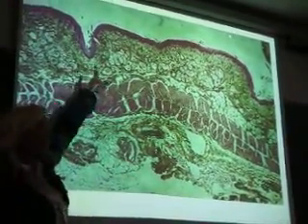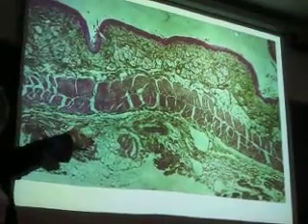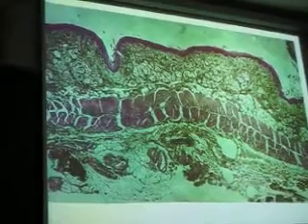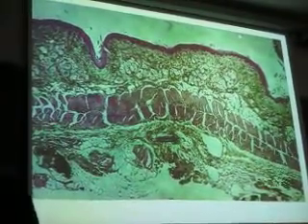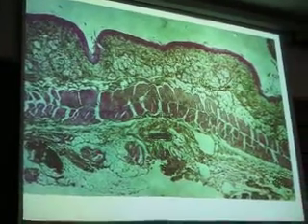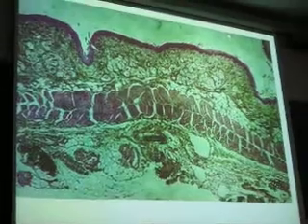So if you can't see the lumen and the mucosa very well, or you have some sort of idea, use deductive reasoning. Go somewhere else and see what you can find. See what piece of evidence you can use to back up what you're thinking. Don't just look at the slides and say, well, I don't recognize that slide, throw your hands up and say, forget it. I don't recognize it. That's not what we're trying to teach you. You guys know this stuff. We've gone through 75% of the semester. You know the types of tissue that you find in the human body. You should know how to recognize them under a microscope.